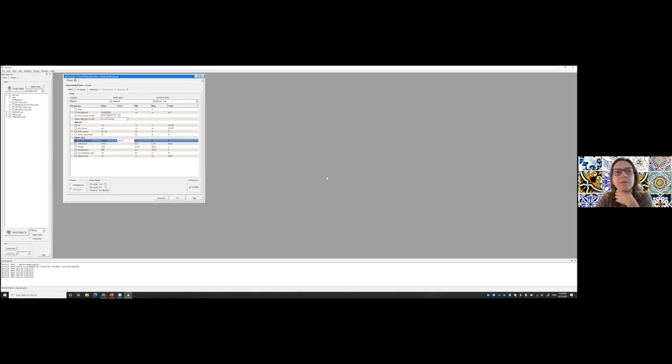Just one more question. Can we constrain some parameters between two different data sets? For example, I have done something deuterated, something hydrogenated, and I know at least the radii should be the same for both.